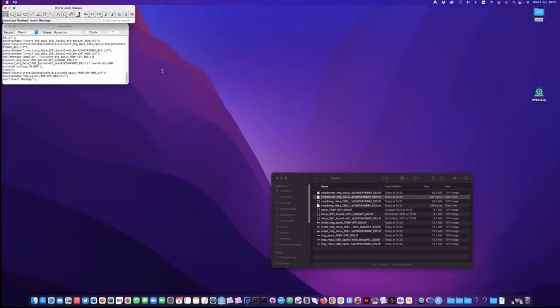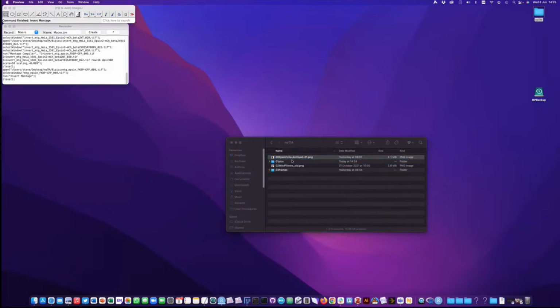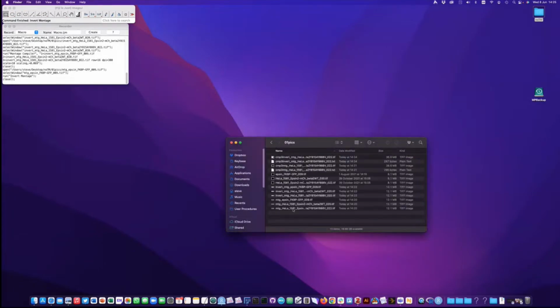The other variation that you might want to do, and was shown on that original image, is we have these ROI zooms shown in the figure. So I'm just going to show you how to do that quickly. So if I go back to my montage here, actually that's a bad one to do. Let's take this one.